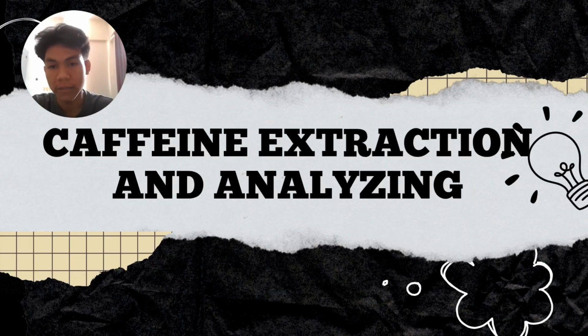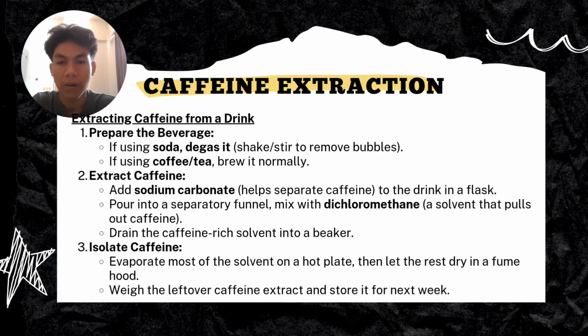Next, we have caffeine extraction and analyzing. For caffeine extraction, first you need to prepare the beverage. If using soda, you need to degas it, or if you're using coffee or tea, brew it normally. To extract the caffeine, they add sodium carbonate, which helps separate the caffeine into the drink in the flask. Pour into a separatory funnel, mix with dichloromethane, a solvent that pulls out caffeine, and drain the caffeine-rich solvent into a beaker.